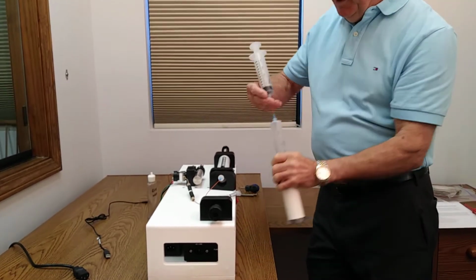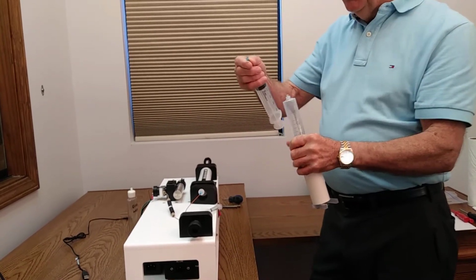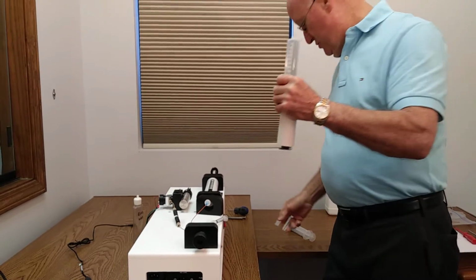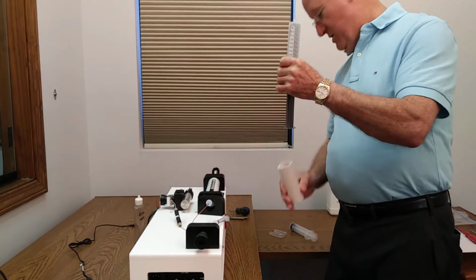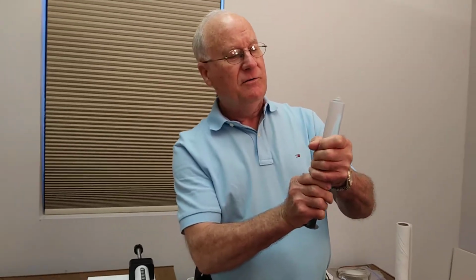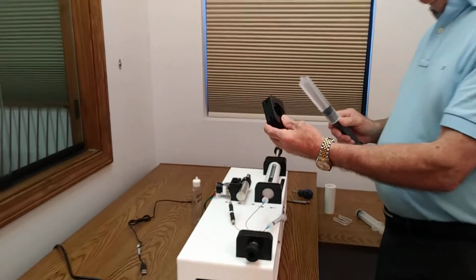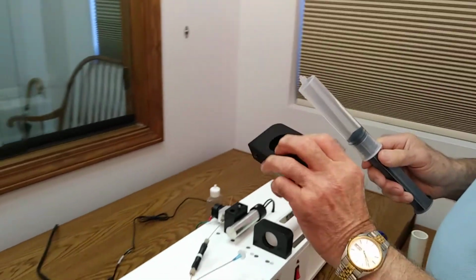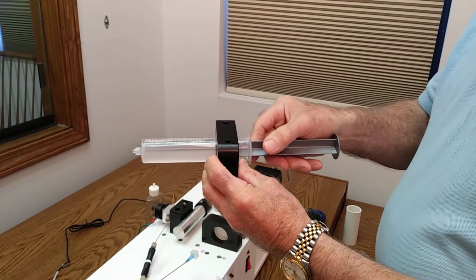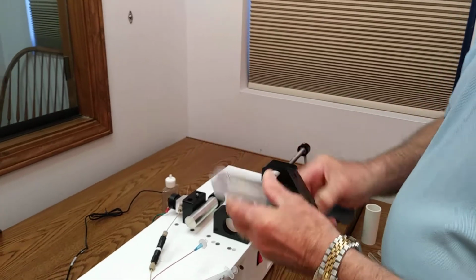I'm going to disassemble. I hold on to the blue fitting. This is called a luer lock fitting. Remove this little clip, remove the pipe, and gently force all the air out the top of the syringe. I'm going to put it back in the syringe holder. It is keyed. This side does not have a recess. This side does have a recess. So I gently place the syringe through there, push the collar up into the recess.